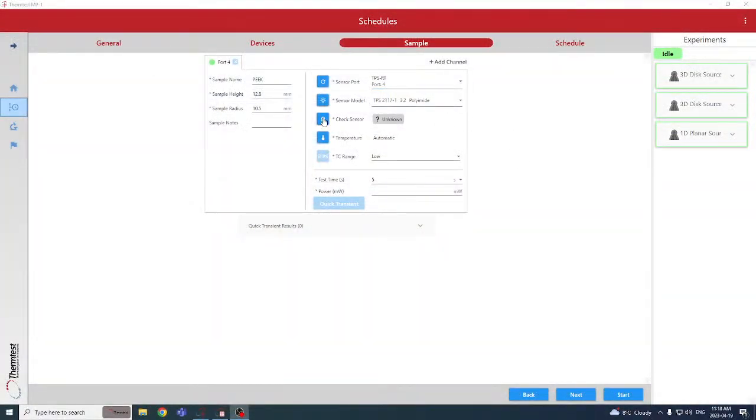So here's our software. So let's check the sensor, make sure that we have good electrical contact. So this verifies the electrical resistance. It's good. The temperature is taken from the adapter itself. It has a PT sensor integrated into the adapter. If you were using one of the temperature platforms, it'd be identical. You'd be drawing the temperature from the actual device itself.